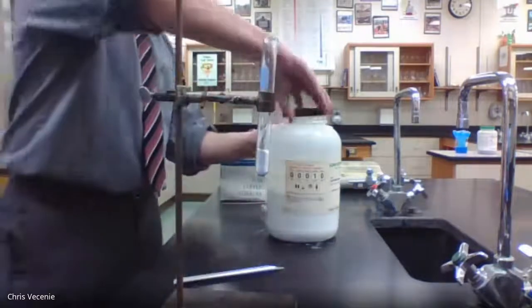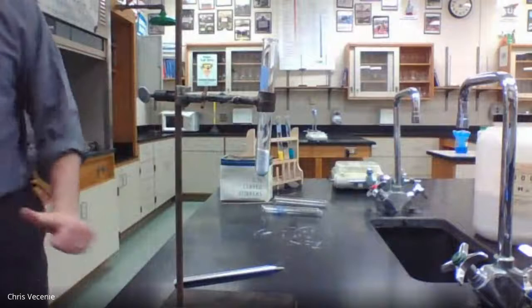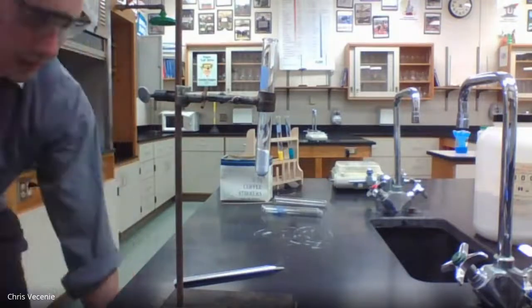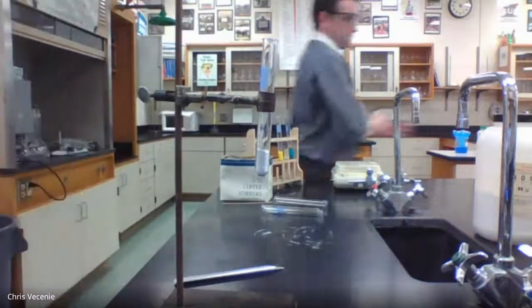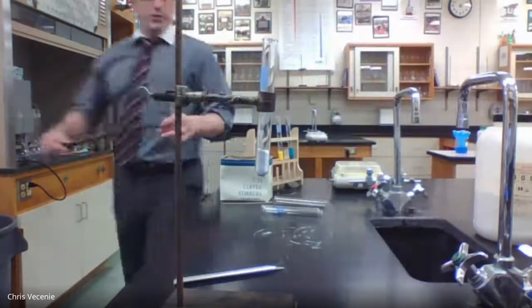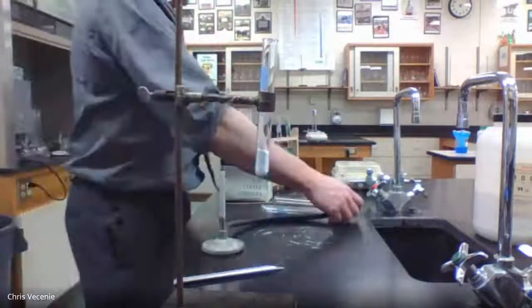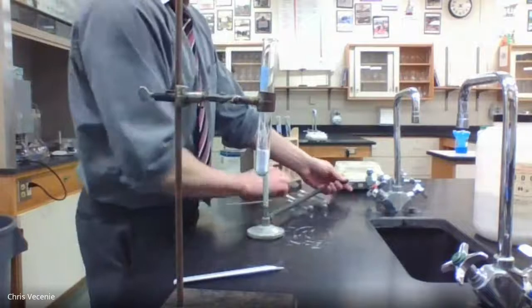What I'm going to do is simply heat this with my Bunsen burner. So I'm going to go in my drawer, take out my Bunsen burner, and hook it up to my valve.